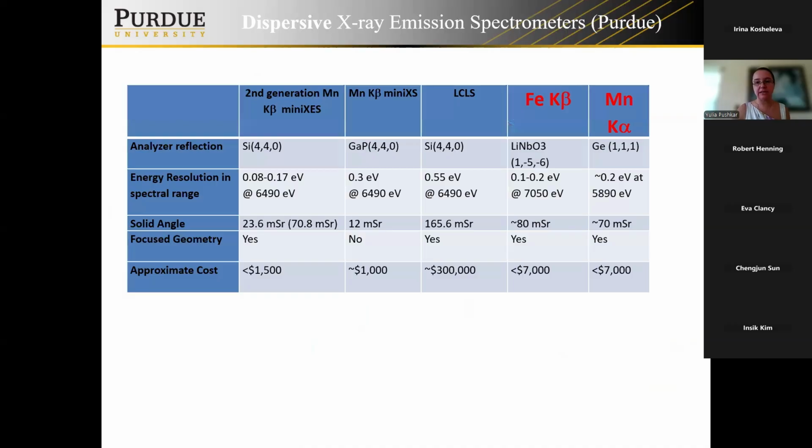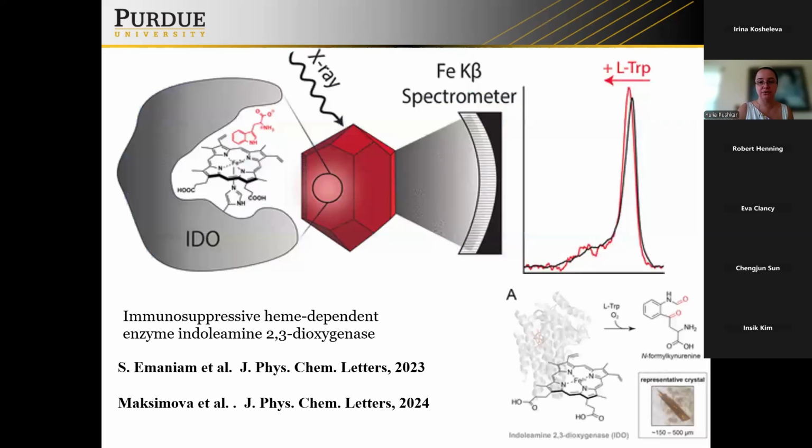Okay, from this, I will move on. As I advertised, we now have several boxes. So we built iron K beta and manganese K alpha boxes. If you want details, I can give them to you. I'm happy to collaborate, to give my box or come and help you with my box for your beam time. And if you use those for concentrated samples, that's magic. It's so easy to use. And we published some papers for battery materials, catalysts, fuel cell catalysts.